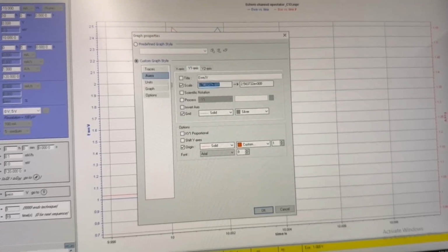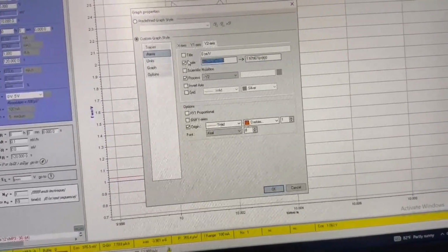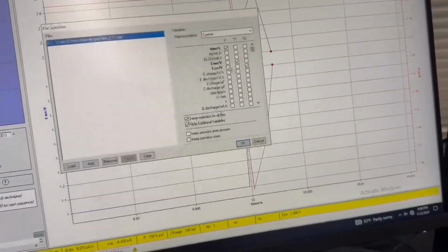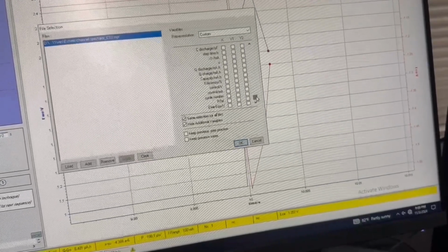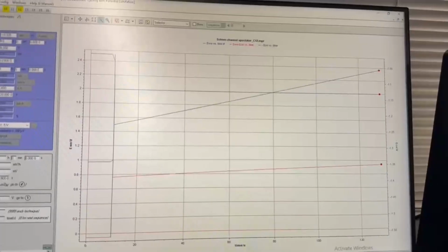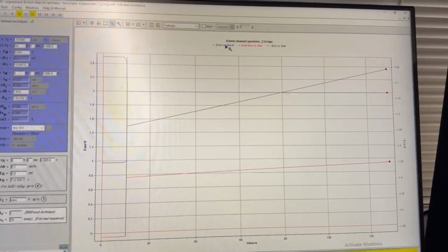After the measurement starts, you can go to the graph properties. Go to the axis that's showing the potential of the counter electrode and make sure it shows the negative value of the initial value. While you're selecting the variables on the graph, the EWE is the cell voltage, ECE is the negative value of the counter electrode, EWE minus ECE is the potential of the working electrode. By applying this technique, the potential of the working and counter electrode and the cell voltage are all monitored.